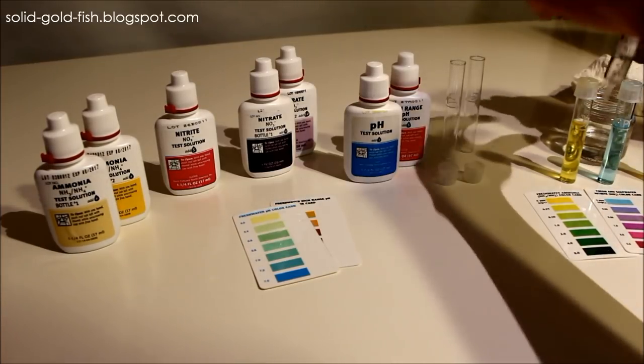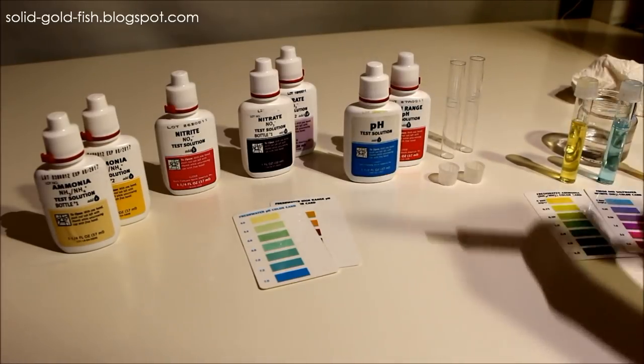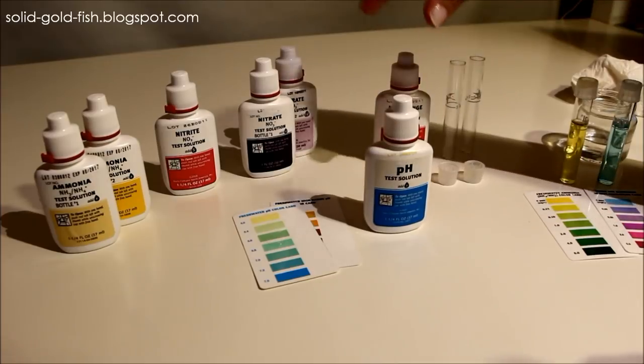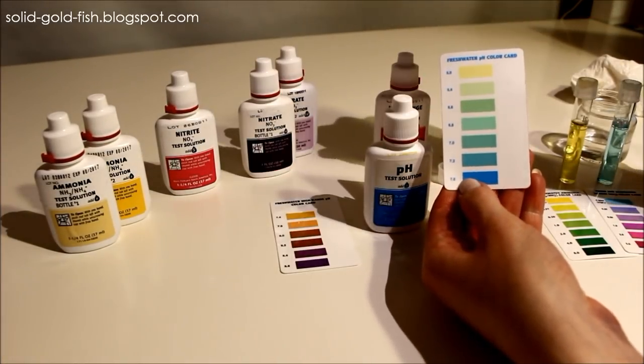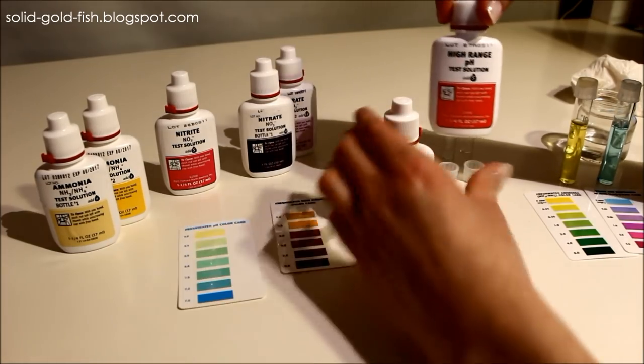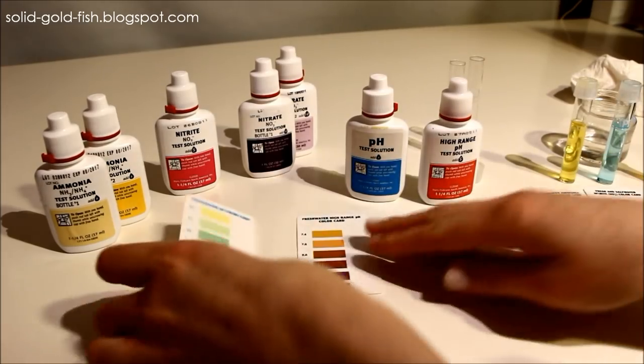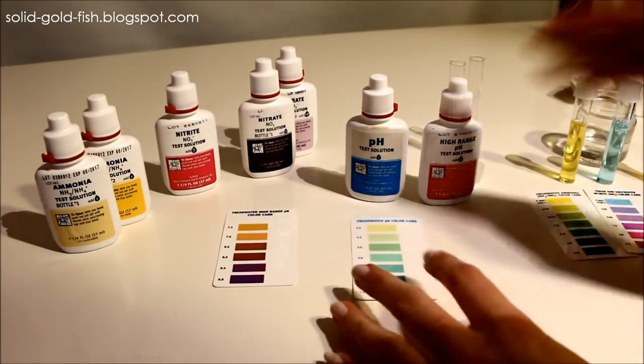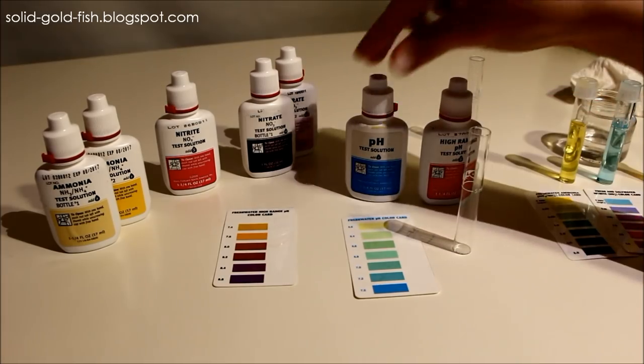The pH ones are really easy and it comes with a regular pH test which tests from 6.0 to 7.6, and a high range which tests from 7.4 to 8.8. If you've never tested your water before and you don't know what the pH is going to be, you should use the regular one first.